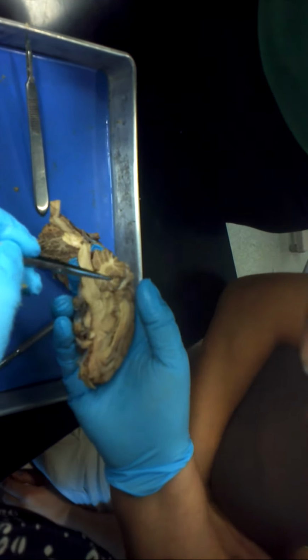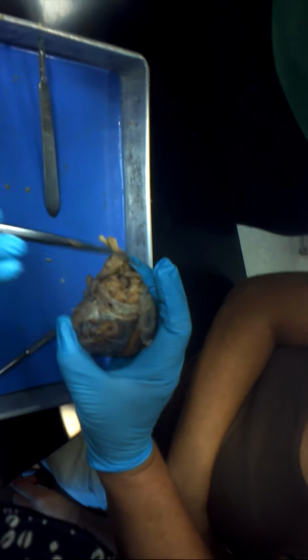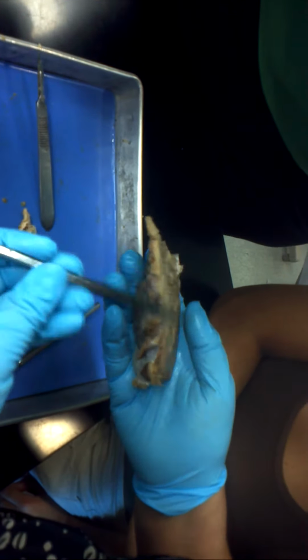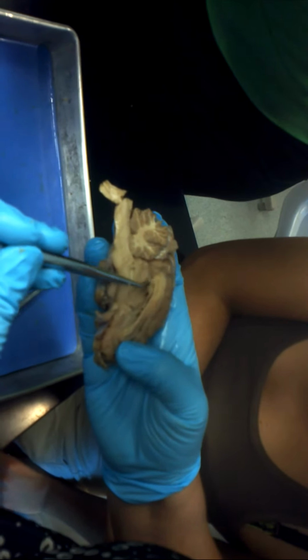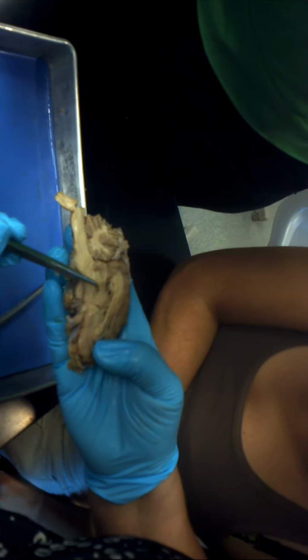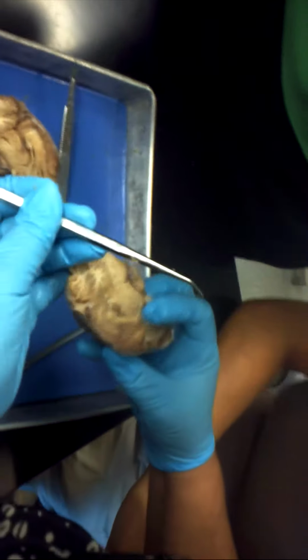Arbor vitae, that's the cerebellum, and the vermis of the cerebellum, of course, is that middle ridge that kind of got chewed up. Your brain was actually better. Theirs was too congealed, so everything kind of blended in. There you can see what is left of the pineal gland, right there. See how you can see the distinction between the superior and inferior colliculi? Mm-hmm, the color. And you can see the cerebral aqueduct. So your brain was actually better.